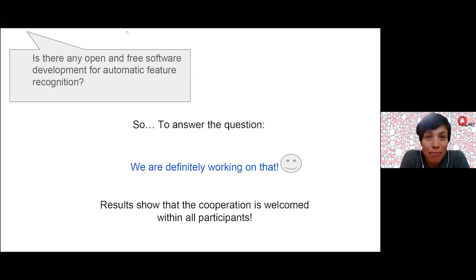We do have a burning question for, I think, Jan: exactly how long will it take for the collection of one 3D image in a cube of 1 cubic centimeter?